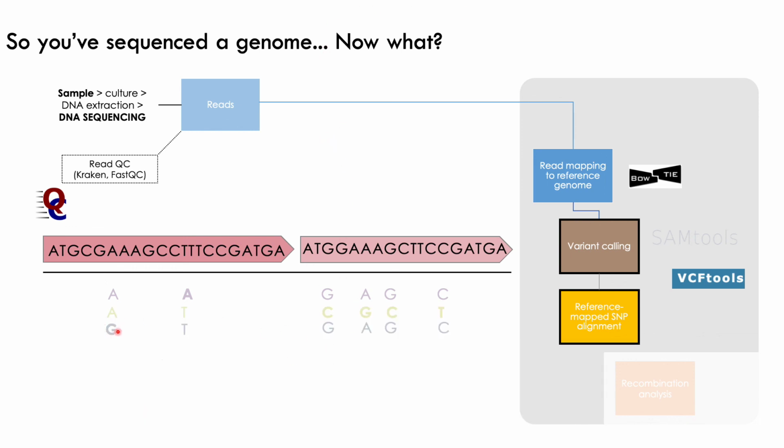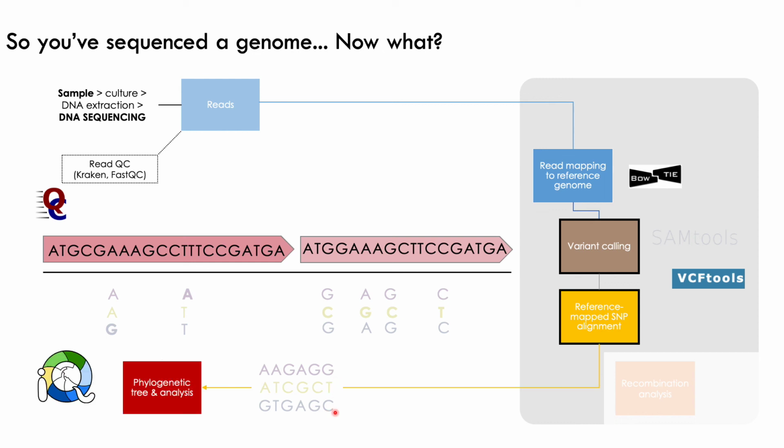So you can see here I've just moved them all up so that they're a bit squished. And then here I've removed all of the excess space. So you can very clearly see the alignment. You can see bases that are the same or conserved between different genomes. So, for example, AA in the purple and green, which is a G in the blue genome, and so on. And this is now what we can use as input for our phylogenetic tree.